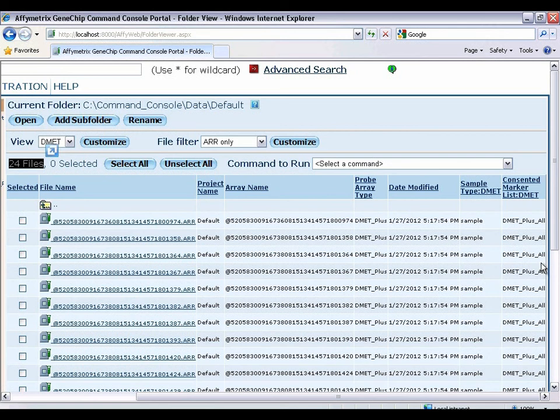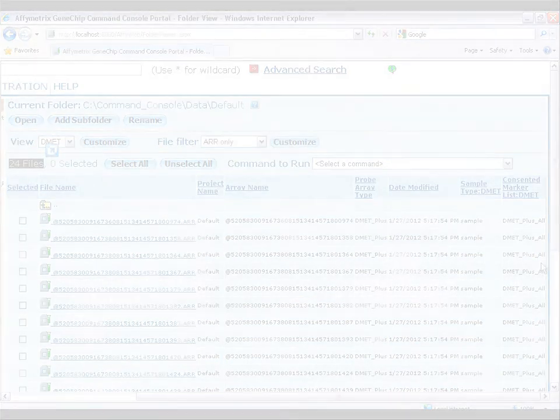At this point, we can load the chips into the scanner and scan them and then process the data in DMET console.